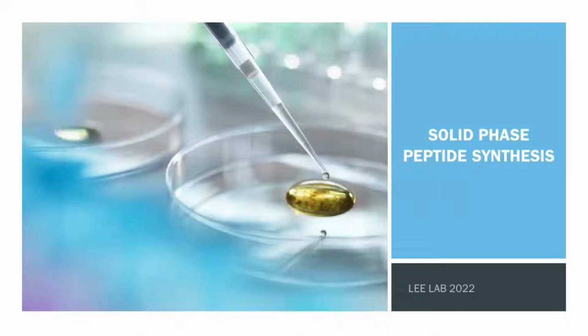Hello, and welcome to the Solid Phase Peptide Synthesis series made by Dr. Naomi Lee's research group at Northern Arizona University. In this video, we will be demonstrating how to fill out the peptide synthesis sheet.